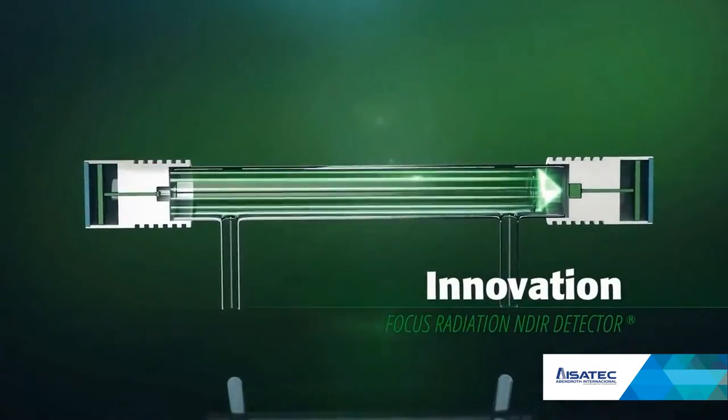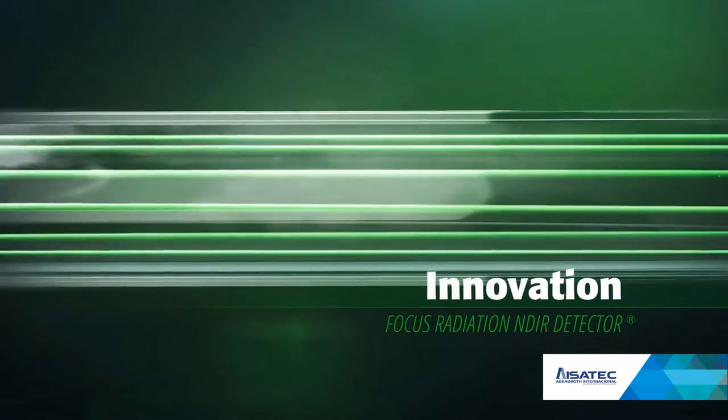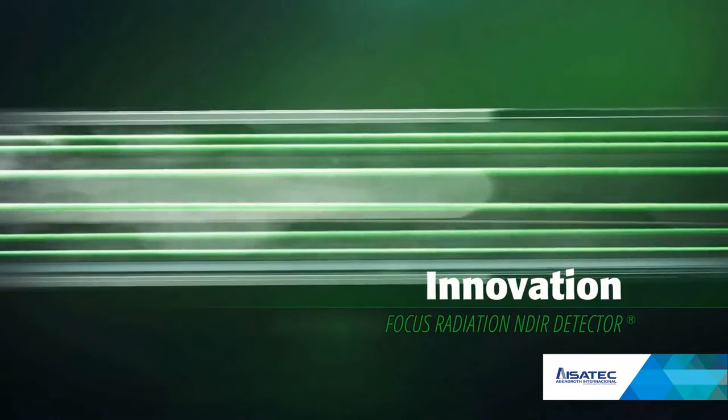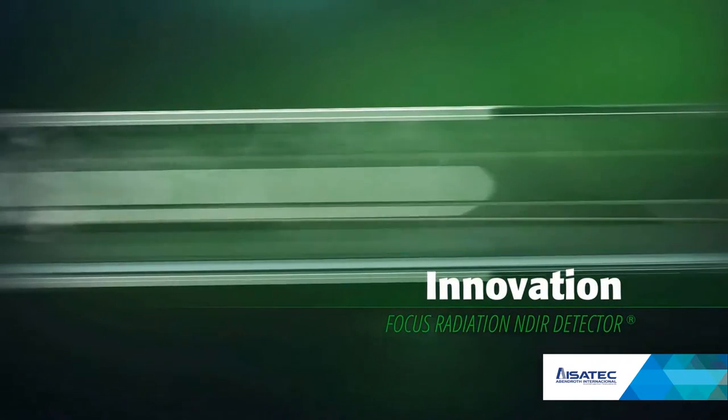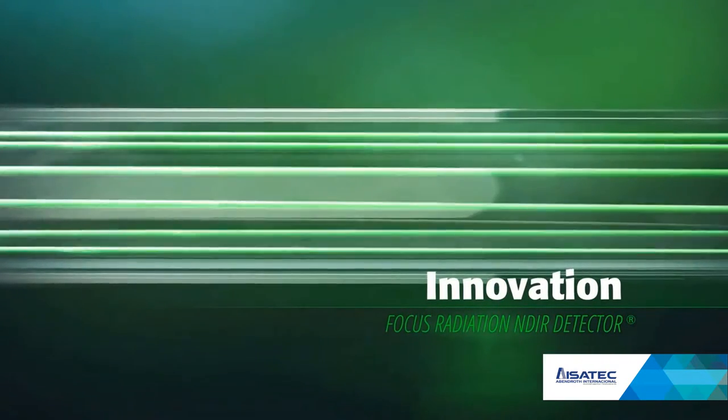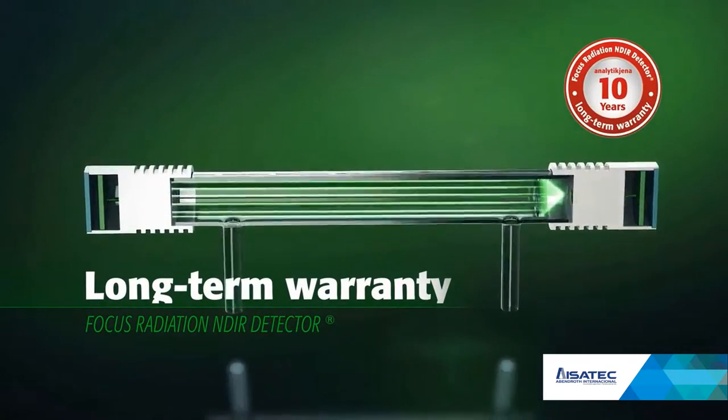As a market leader in optical spectroscopy, Analytic Jena assures that our TOC analyzers contain top quality and durable optical components. The corrosion-free Focus Radiation NDIR detector and the Vita flow management guarantee excellent long-term stability and reliable results.